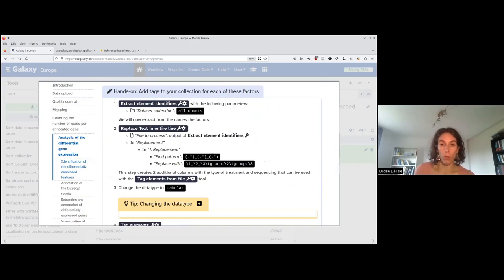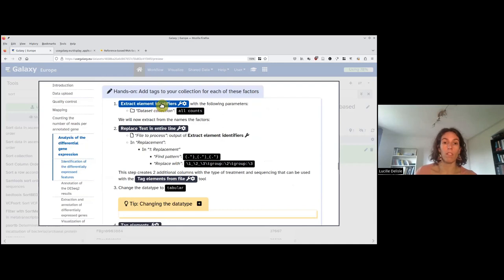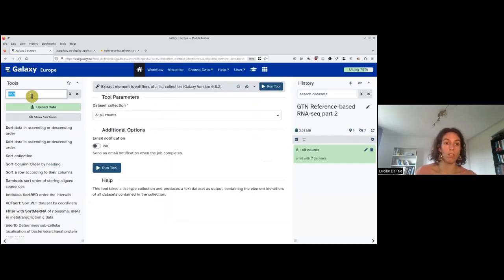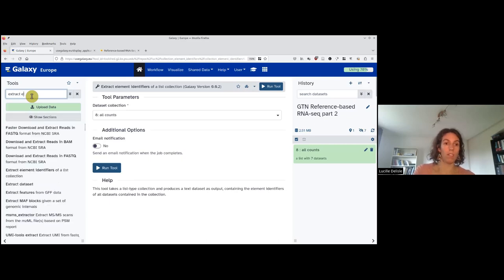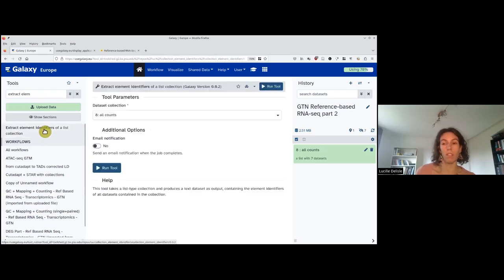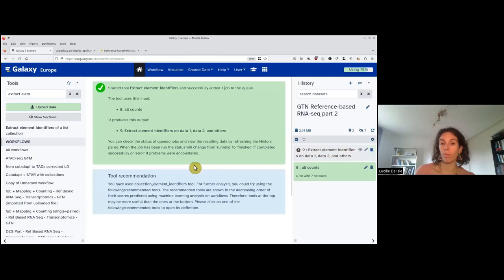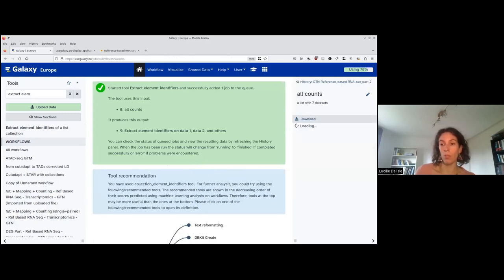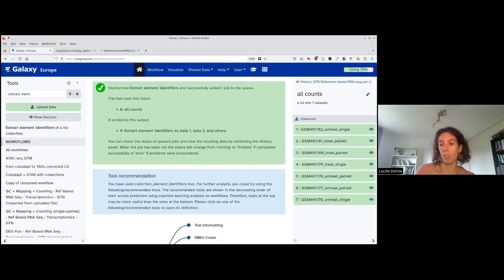We need to use the names from the count collection to attribute tags to our datasets, which will be used by DESeq2. To do so, we first extract the element identifiers. This tool can be accessed by clicking here, or by searching for 'extract element identifiers.' We just check 'all counts.' This will give a list with a text file containing seven lines corresponding exactly to the seven labels.